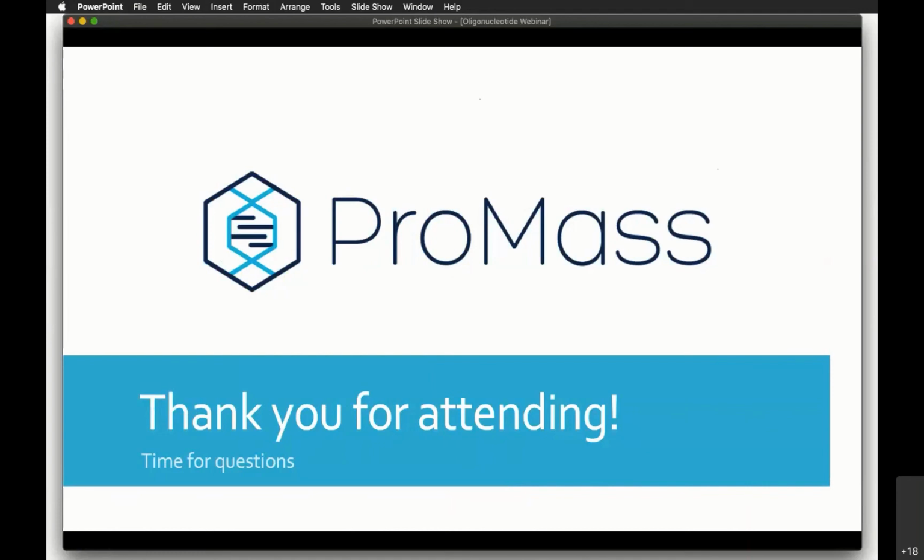Yeah, so I don't have an exact numerical value to give to you for that, but I can say that the variability in purity is probably going to be pretty minimal. It should be fairly consistent. The main things that I would say contribute to that are going to be the amount of sample that's injected and the signal to noise that we can get from that. If it's a very low amount of sample, the purity variability can be a lot greater because you're going to see more noise interference. And sometimes if noise gets picked up and deconvoluted as real data falsely, then that could skew your purity one way or the other.